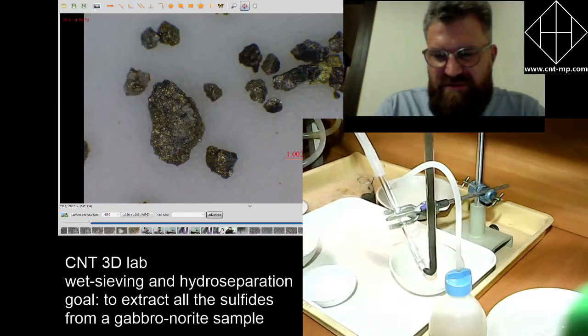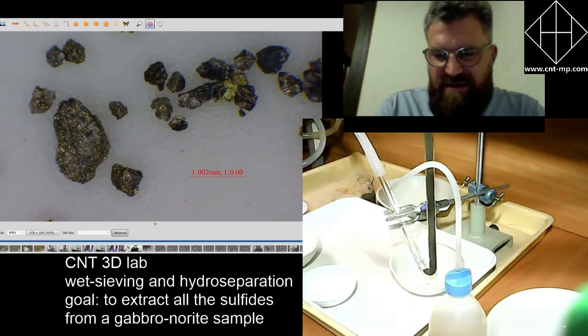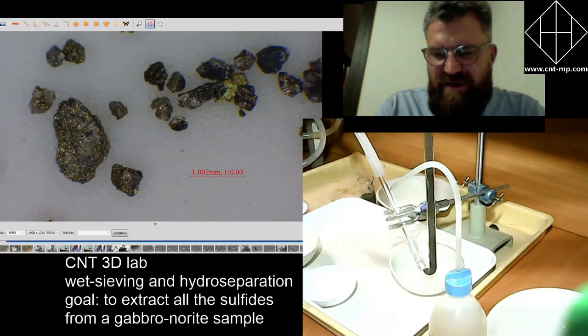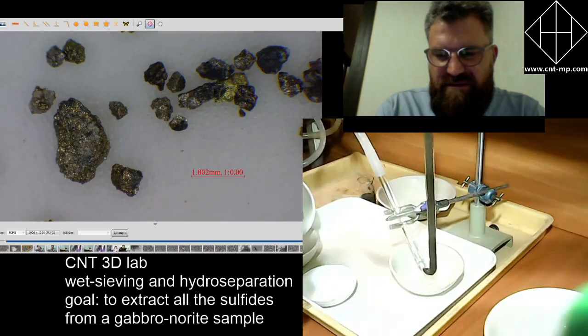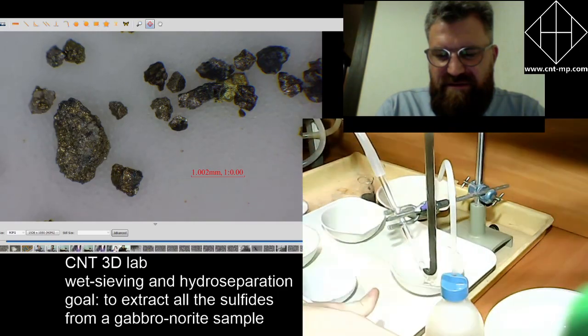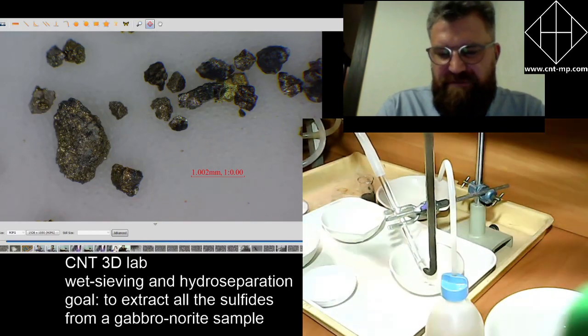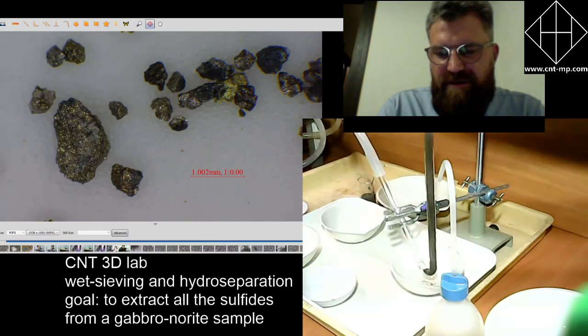Maybe he wants to show us any type of sulfide that is not pyrite. Maybe pyrrhotite. Oleg, what do you want to show us? Oleg?